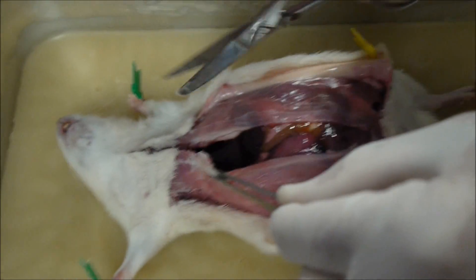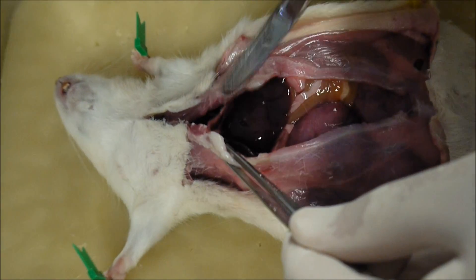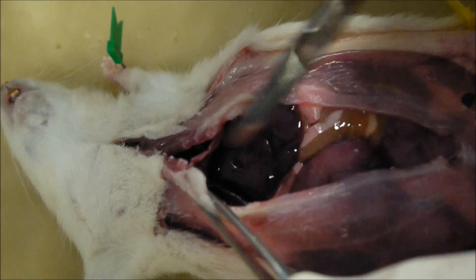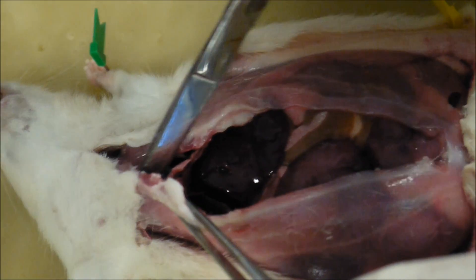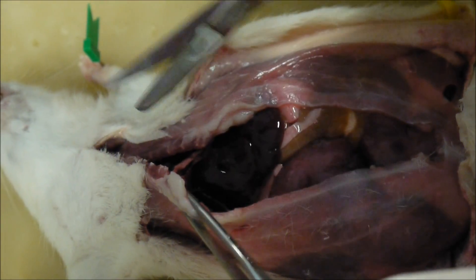So let's cut up here and open that up. Now this layer here, just before I cut any further — this layer here is the diaphragm. This is the abdominal cavity and that's the thoracic cavity. Here's the diaphragm here — that separates the two cavities.